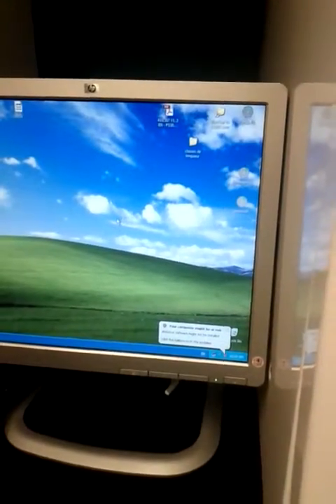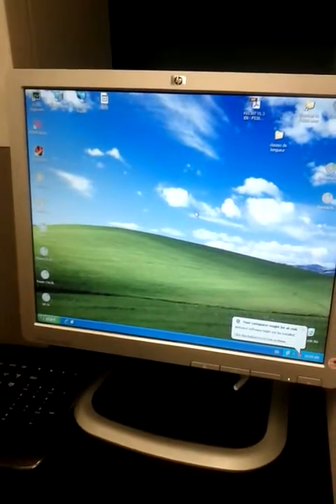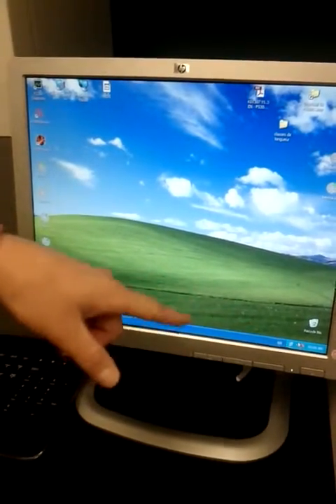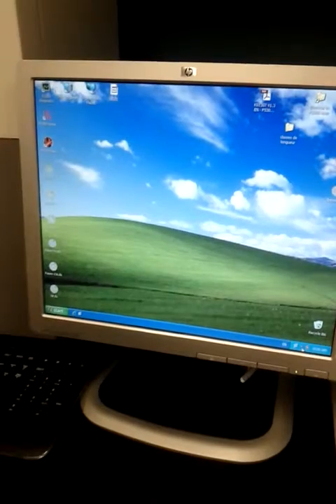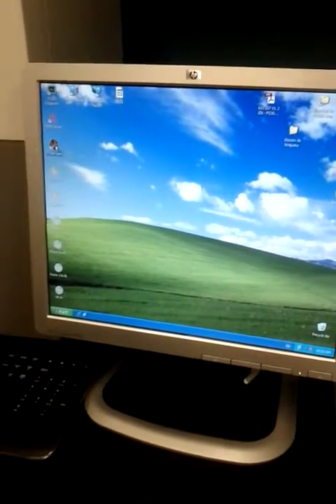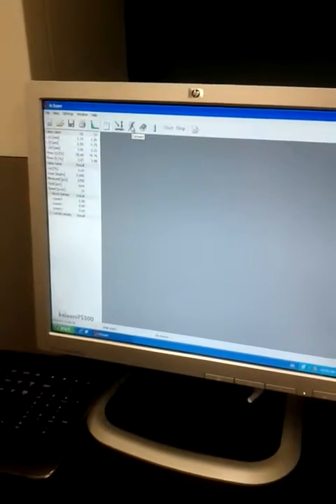The first thing to do is to connect this computer to the server. If you see this gray ball, it has to be green. When it's gray, it's disconnected. In order to connect, you come here, user, and then here, Connect. You highlight it and click connect. It's not connected yet, but it will be connected.